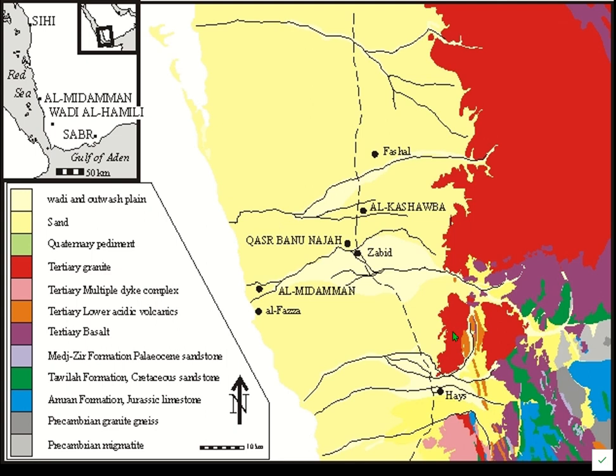And you get these granophyric feldspars quite often in this sort of environment associated with the opening of the Red Sea. I've seen the same in Oaxaca in Mexico, and I've seen published examples from Scotland from the opening of the Atlantic. So it seems to be often associated with this opening of seas sort of phenomenon.